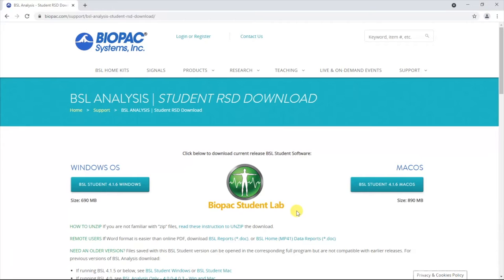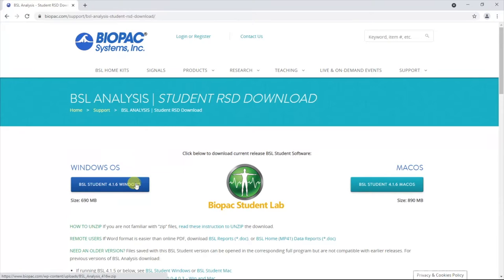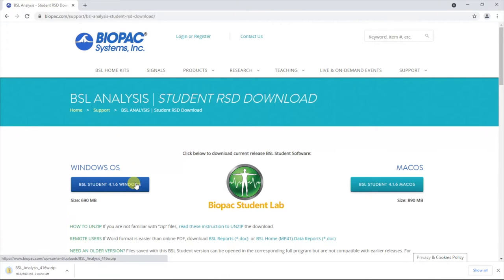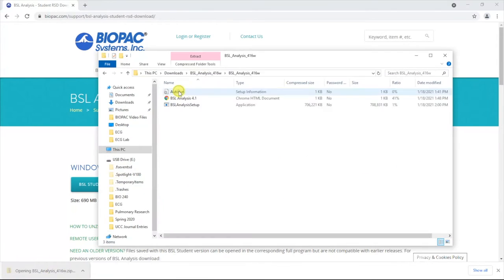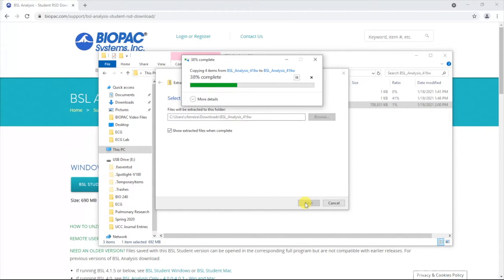From here, select the current release of the free Biopac student software for either Mac or Windows operating systems, depending on your home computer. In this example, we will select the Windows operating system. Once you make this selection, screen prompts will then direct you toward completing the download.